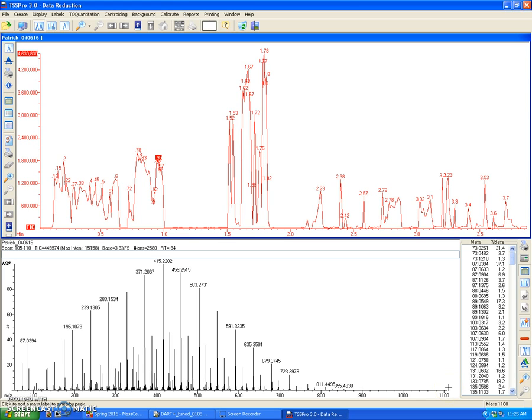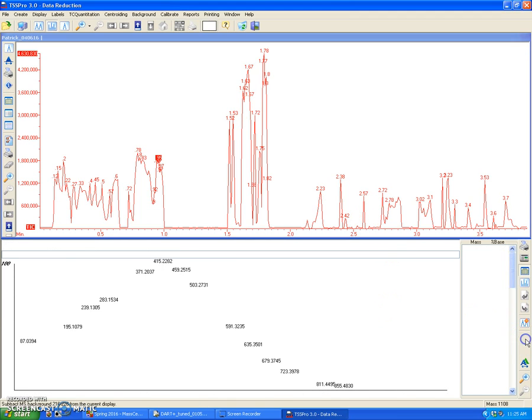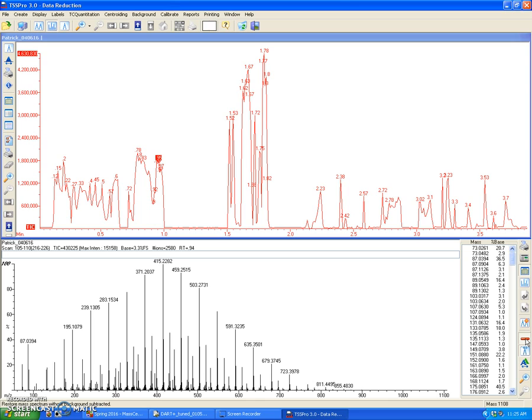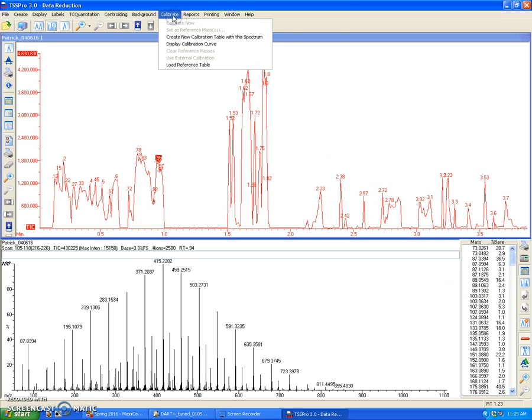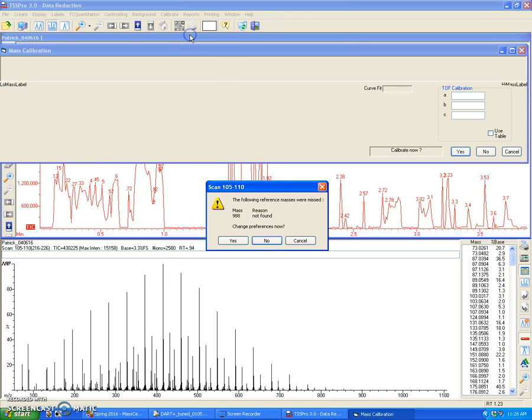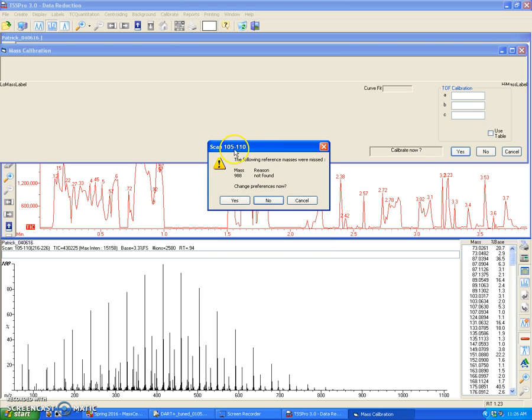Once I find a suitable region to calibrate against, I do the background subtraction first, and this is always good practice to do, so just make sure to do the background subtraction before you do anything with it. Then go to calibrate, create new calibration table with this spectrum that I have averaged.